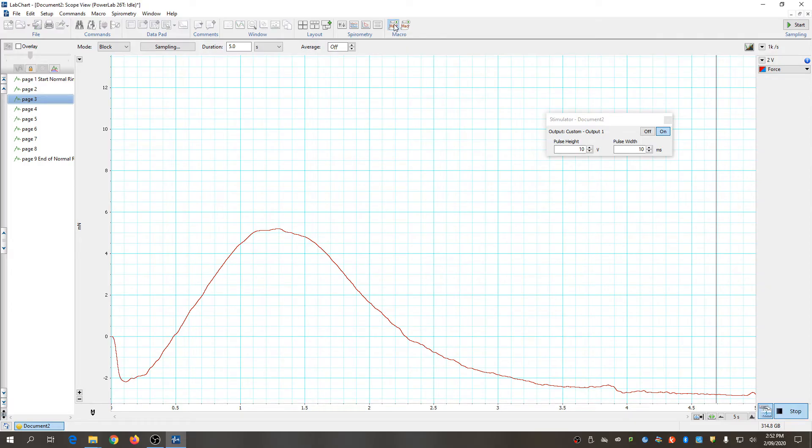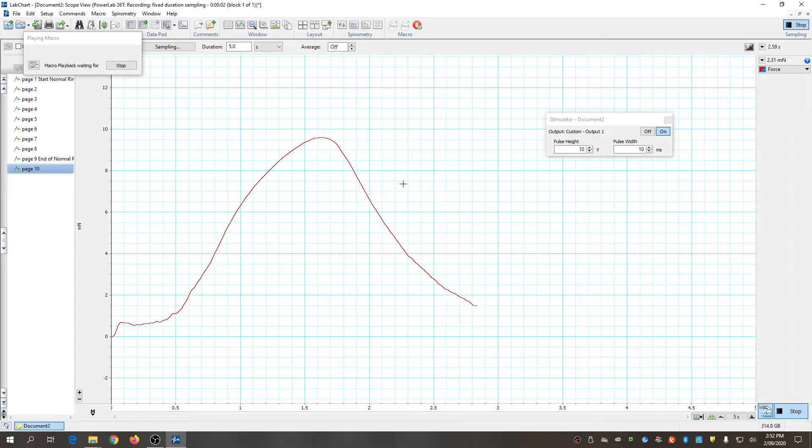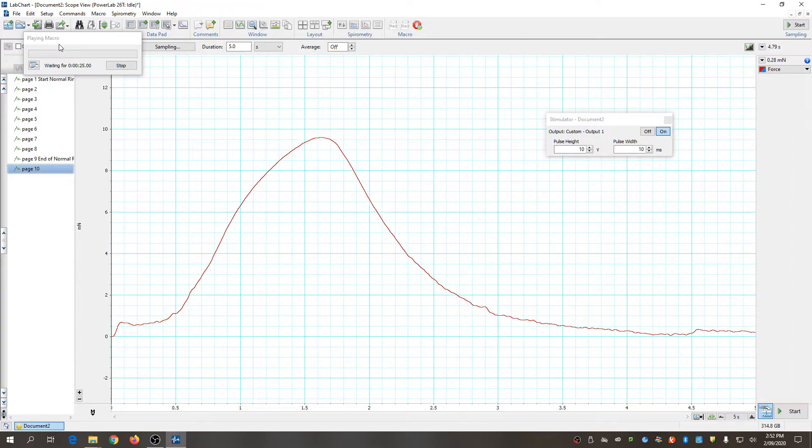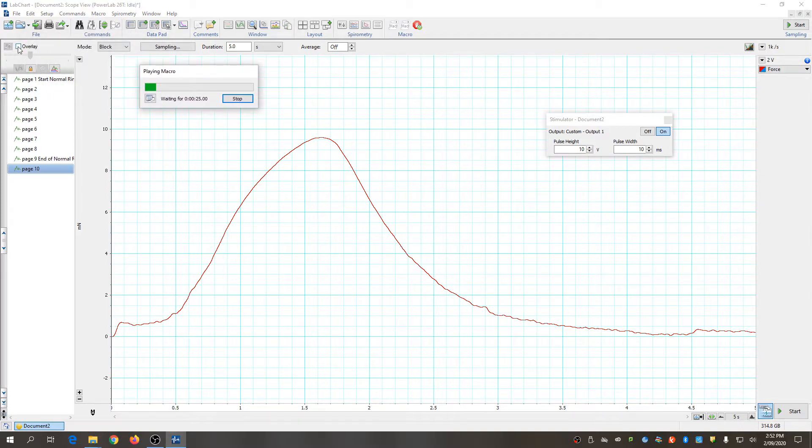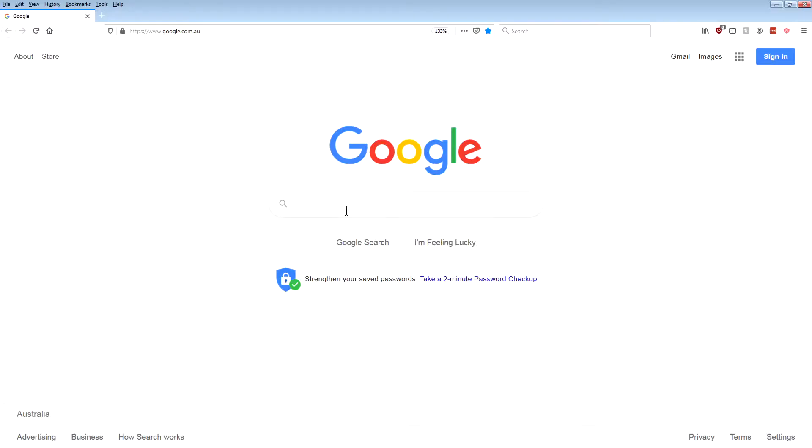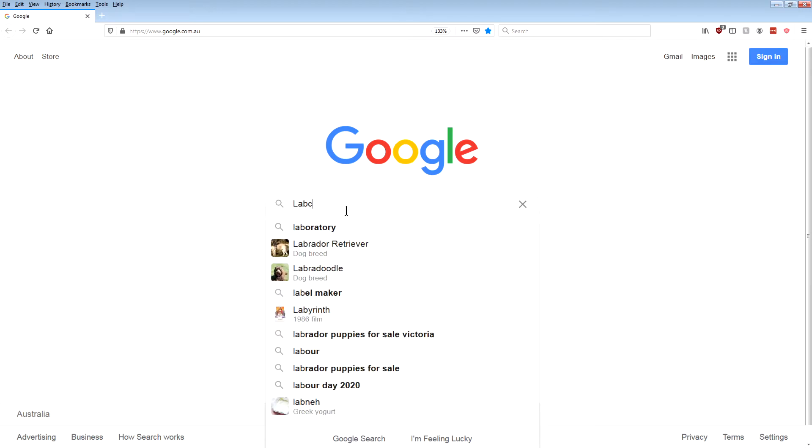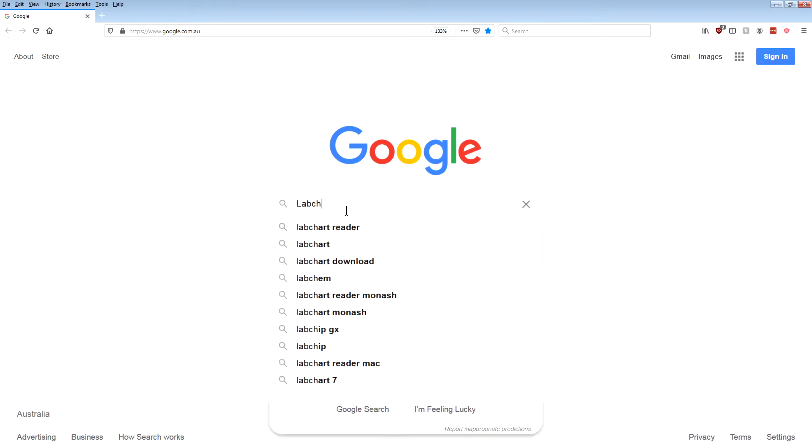The software that we capture the data with is called LabChart, and fortunately there's a reader software, LabChart Reader, which can be used to open up these files and do all the analyses that you need to do. To find that software, just go to Google and type in LabChart Reader.